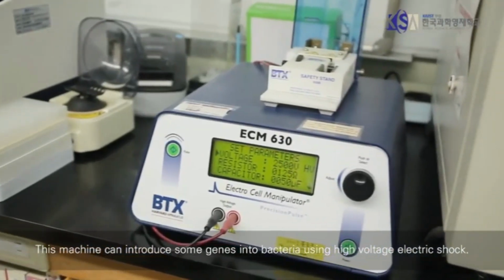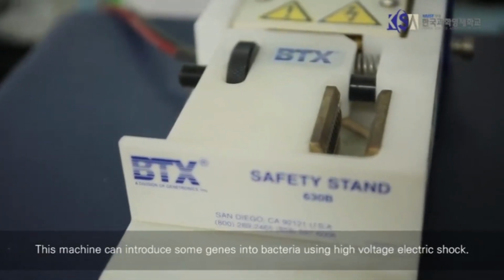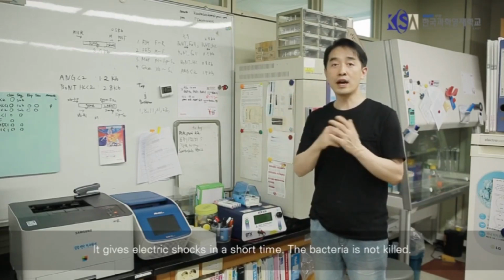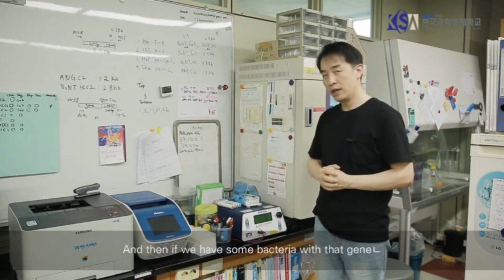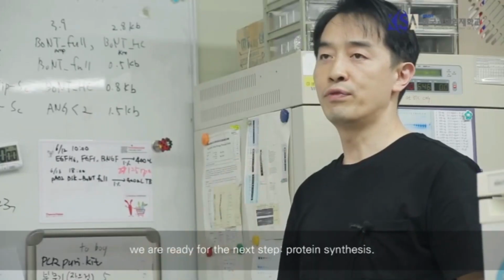This machine can introduce some gene into the bacteria using a high voltage electric shock. It gives an electric shock for a short time, so the bacteria are not killed, but only DNA is inserted into the bacteria. And then if we have some bacteria which have the gene, we are ready for the next step, protein synthesis.